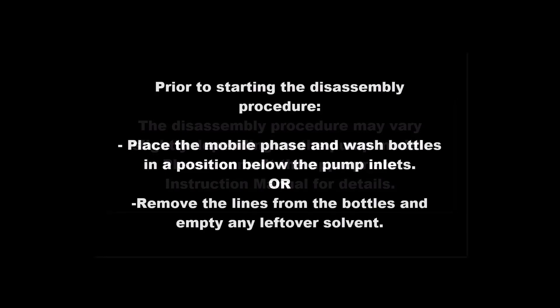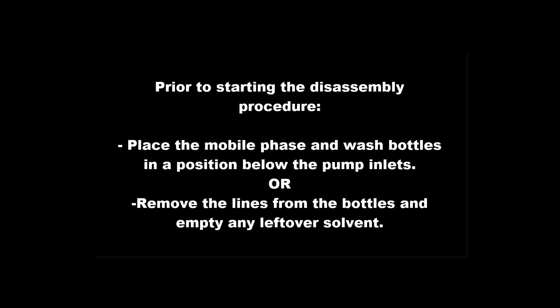Before beginning the procedure, place the mobile phase and wash bottles in a position below the pump inlets, or remove the lines from the bottles and empty any leftover solvent.